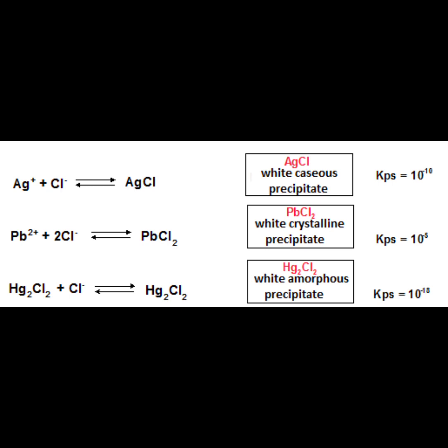Okay, suppose someone gives you an unknown inorganic substance. How do you find out what's inside? We take the substance and we put it in a test tube. We add 2N hydrochloric acid and mix the content of the test tube, stirring with a glass rod. To speed up the process, we work in a hot, not boiling, water bath. At the same time, we will dissolve the residue, the unknown substance, and precipitate our insoluble chlorides.